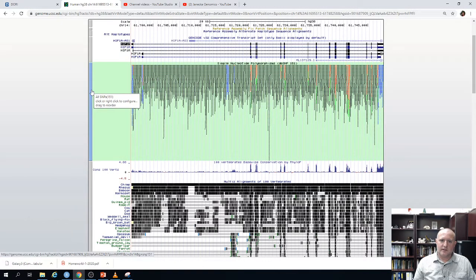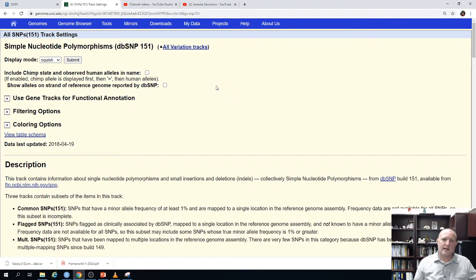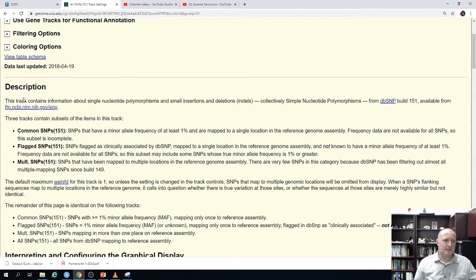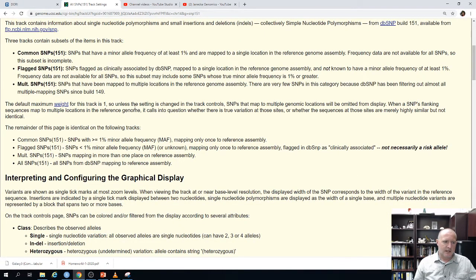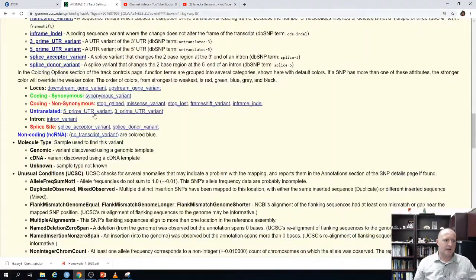If we click on the track itself, it brings you to a page describing what's in that track — where it comes from, a basic description, what version it is, and the categories and classes of variants. Scrolling to the bottom gives us the color key: black means an intronic variant; blue means an untranslated region variant; red means a non-synonymous variant in an exon that changes the amino acid sequence; and green means a synonymous variant where the SNP is in an exon but doesn't change the amino acid.